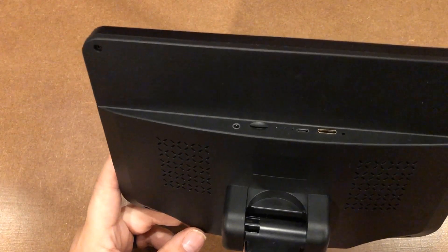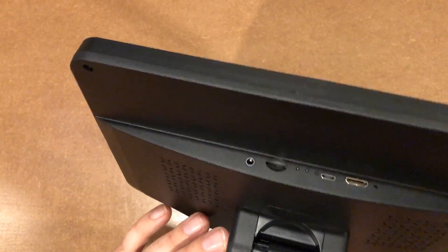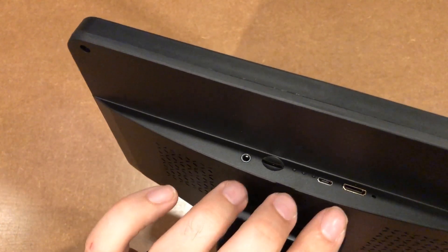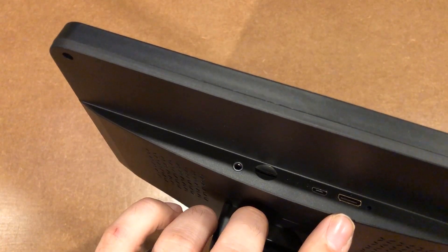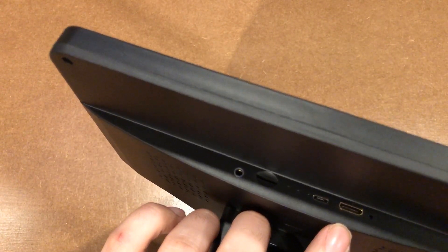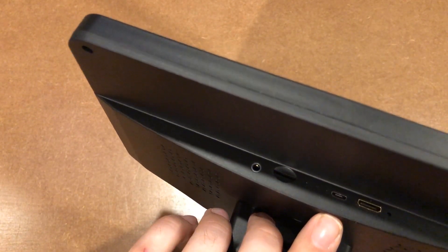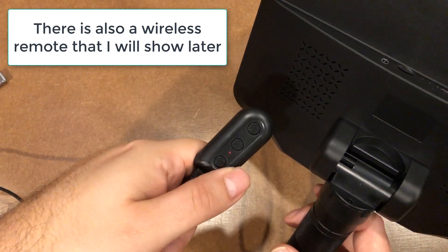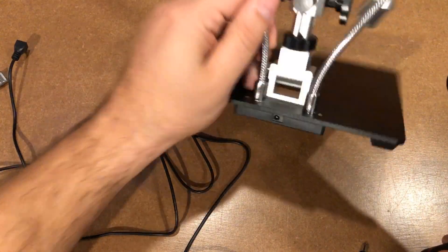If I sound over the top about this thing, it's not because a company asked me to do a commercial. I had gone around and done some research trying to find very specific features in a microscope, came across Andonstar, and they were nice enough to send me this one for review. What I really wanted was this HDMI port — it's mini HDMI and it came with the cable; you could also use an adapter. Some Raspberry Pi models use mini HDMI so I have connectors for those. I would like to see full size HDMI but it obviously doesn't fit in this space. It also uses micro USB, and it comes with a cable that attaches to this little remote, which allows you to adjust the lighting and turn the unit on and off.